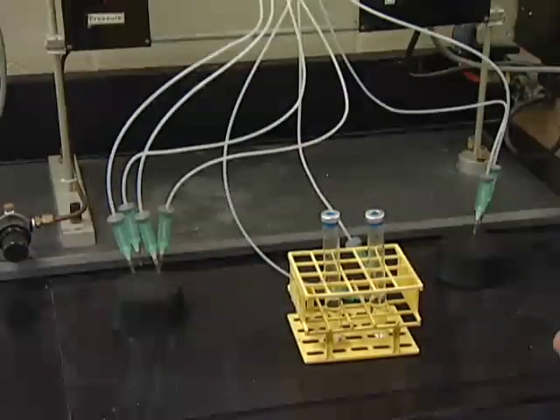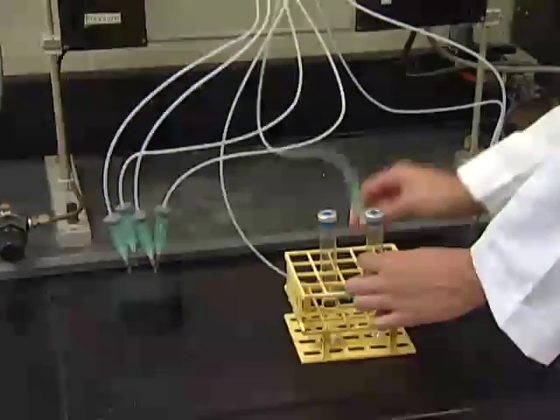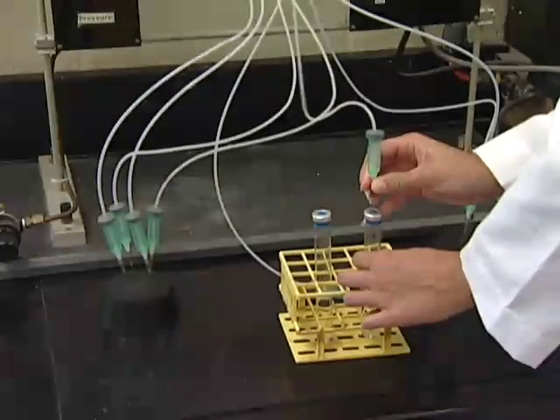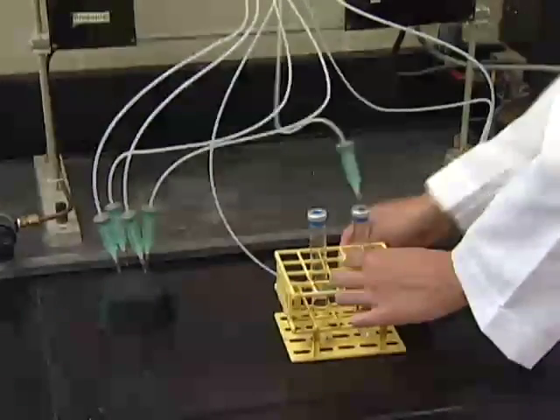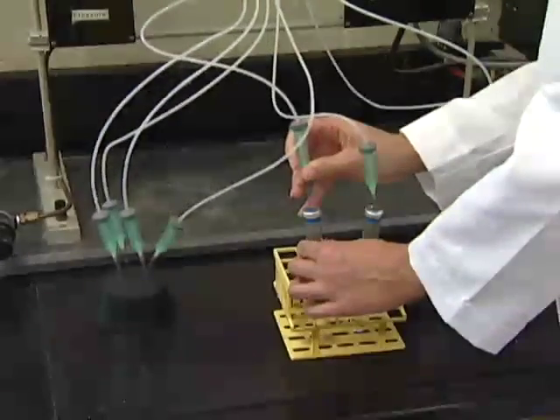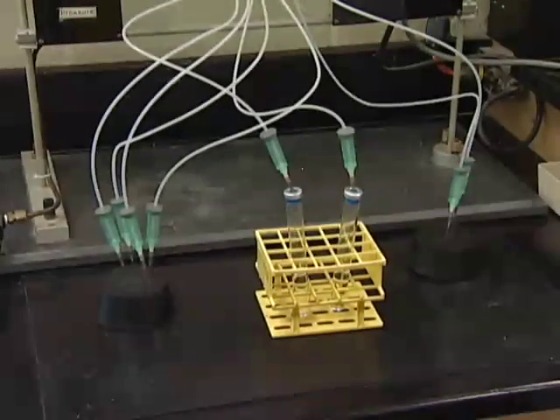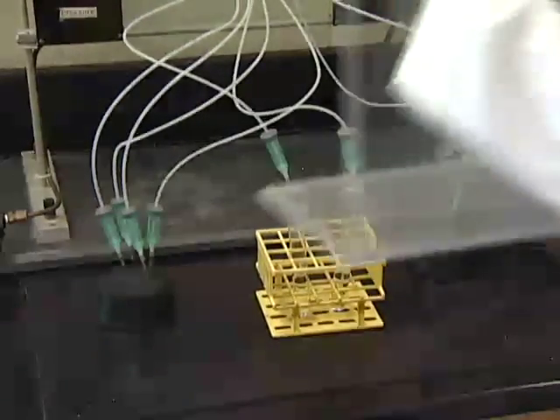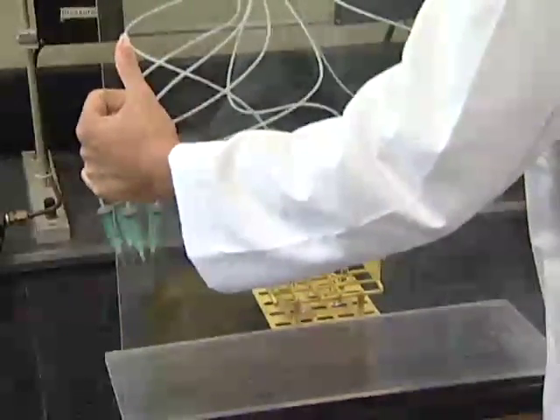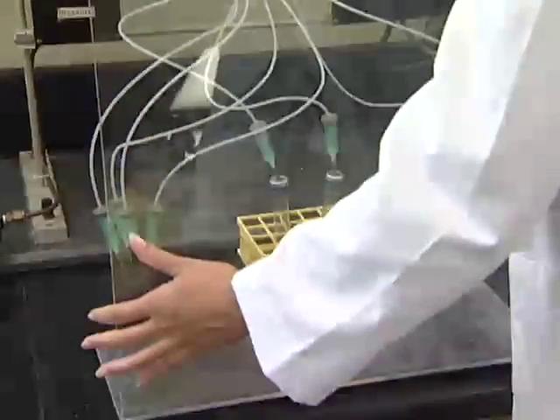Insert the gassing line needles through the stoppers of the tubes you want to change the headspace of. Use some kind of clear plastic shield to protect yourself in case a tube explodes or implodes during operation of this type of system.